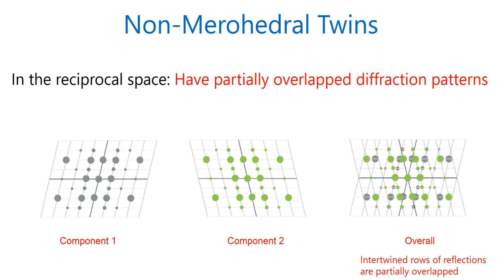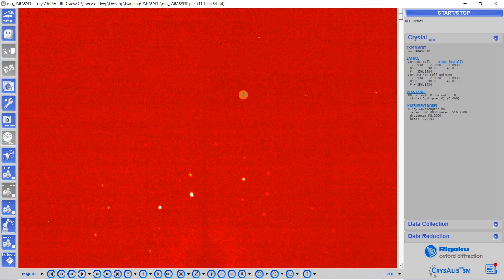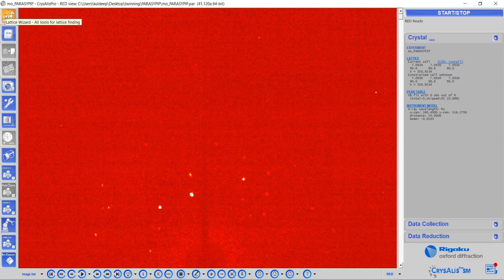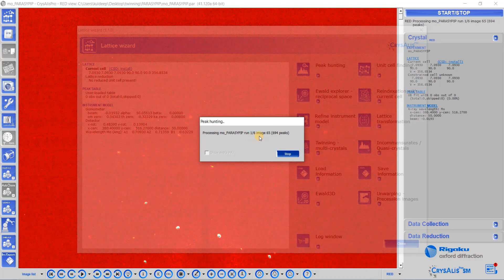So let us go to the demonstration part — how to separate the twin components. Let us start CrysAlisPro first. Just double-click on this icon and it will open up the window like this. Here you can see the interface of CrysAlisPro. Now, what you have to do? Press this button: Lattice Wizard. And you will see a number of options. First go to this tab: Peak Hunting.